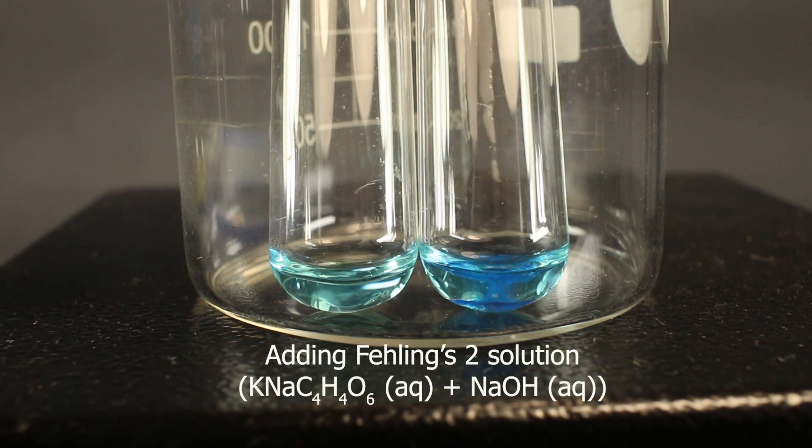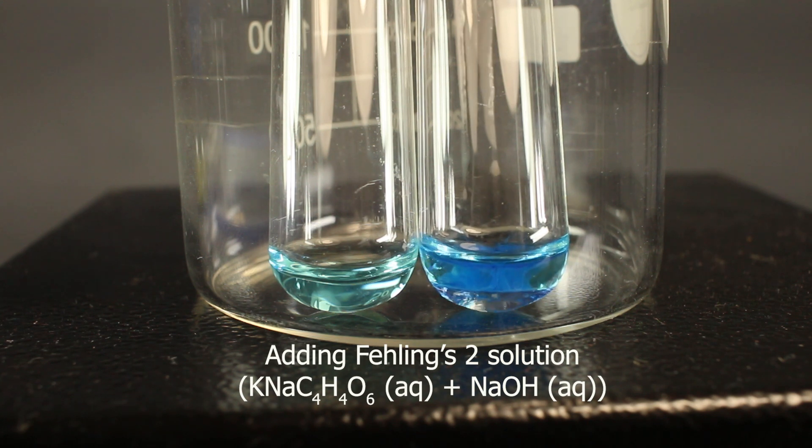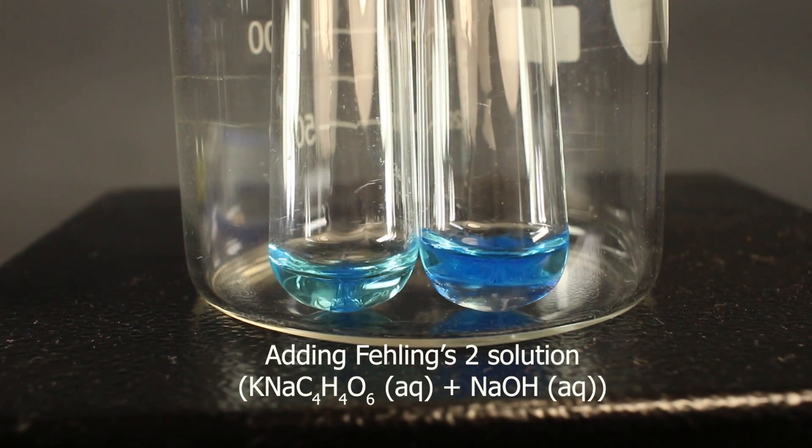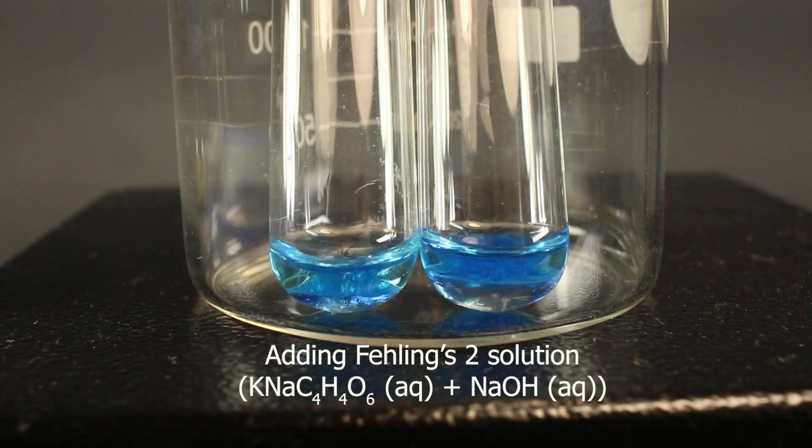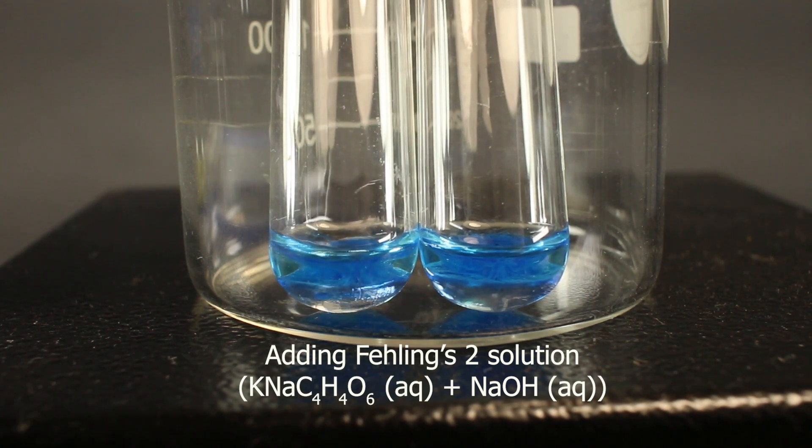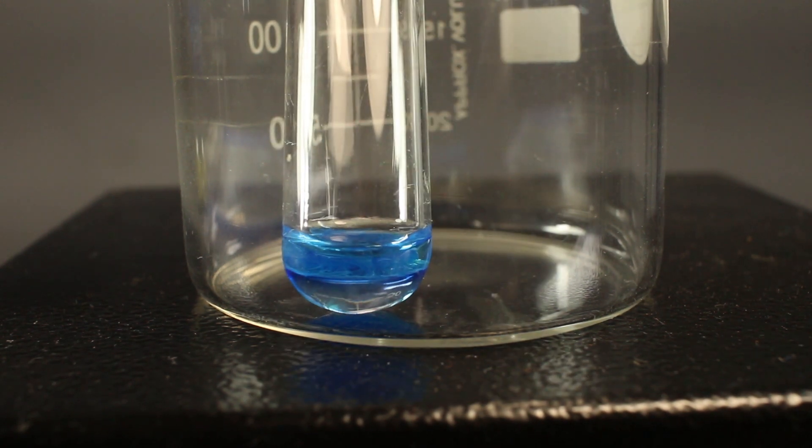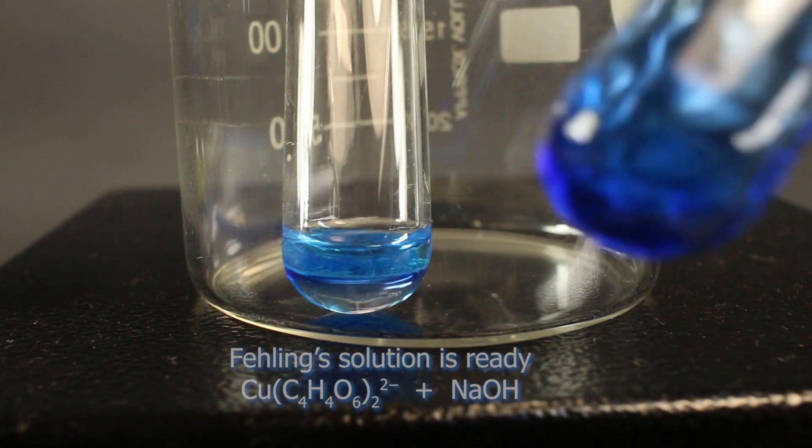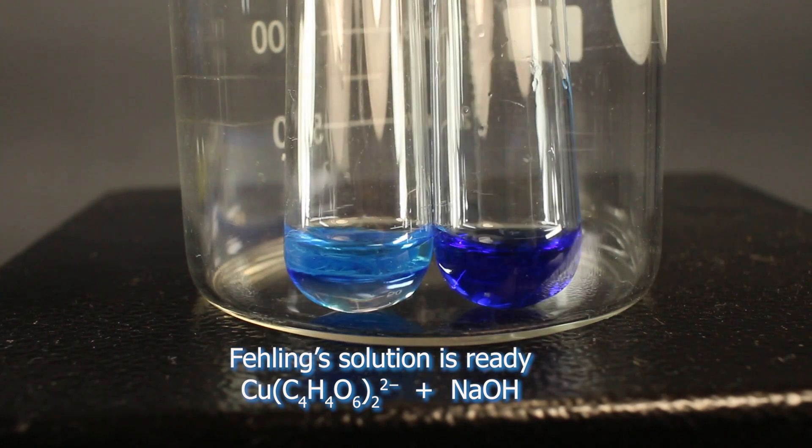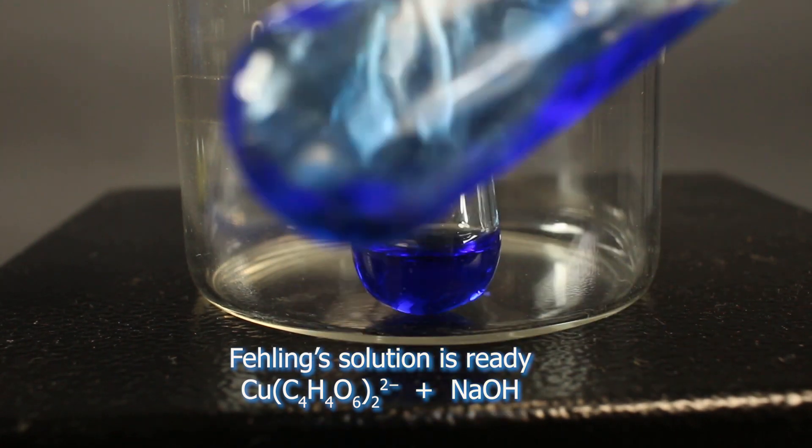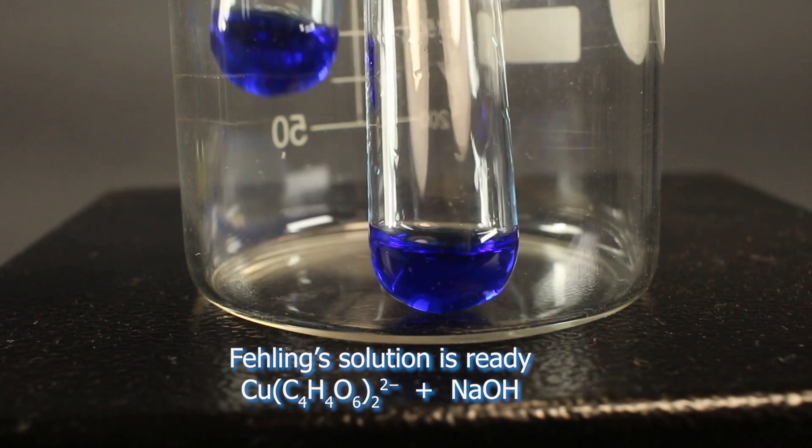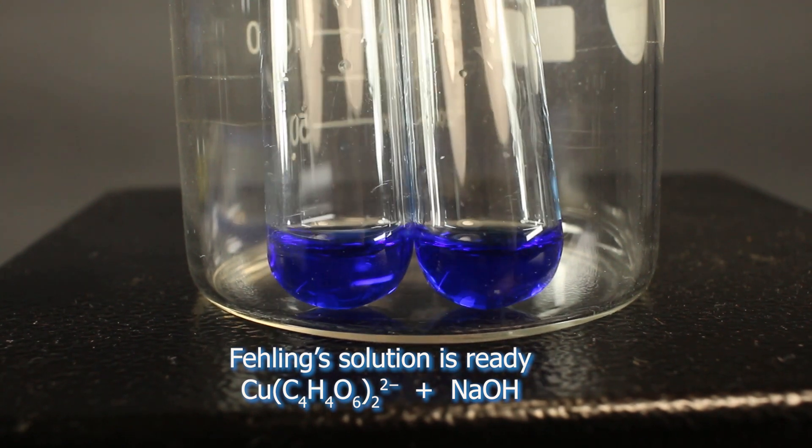Sodium hydroxide, as we add Fehling 2, precipitates copper 2 into copper 2 hydroxide, which is insoluble. You see this blue precipitate, but tartrate can form complexes with copper, making it soluble. Complex of copper with tartrate is deep blue, like here.